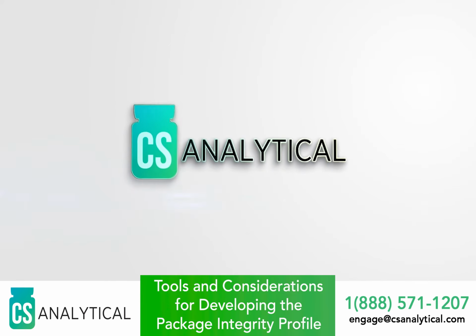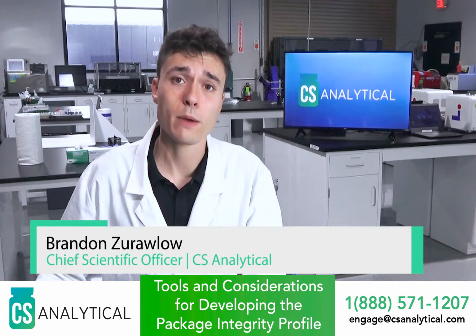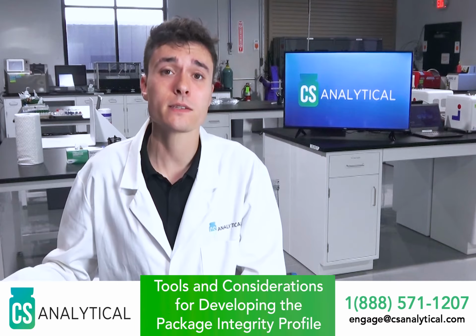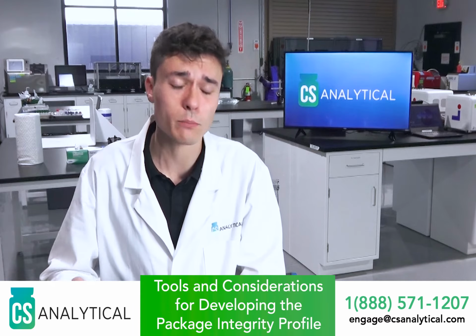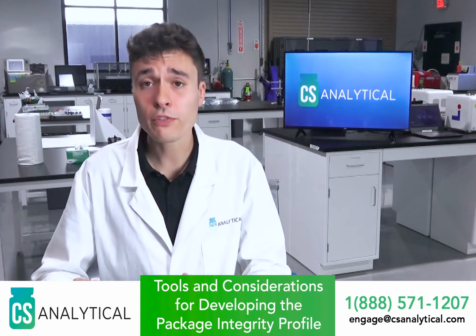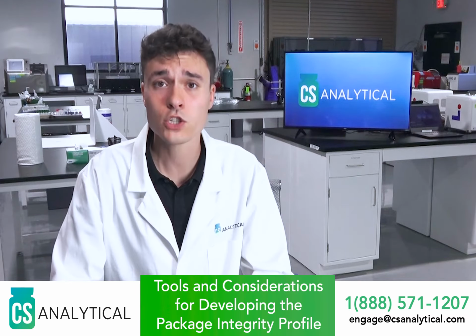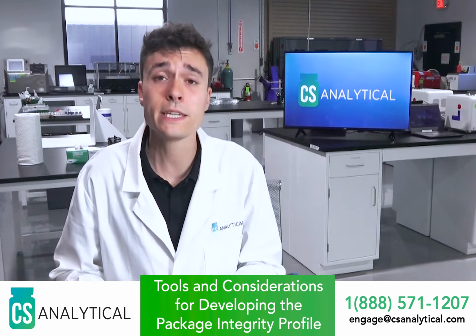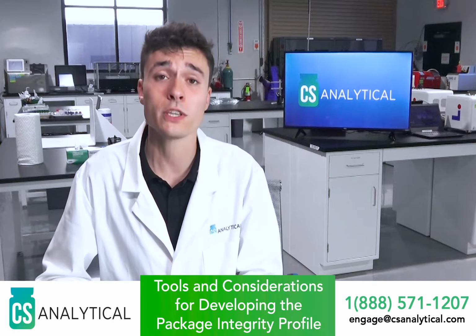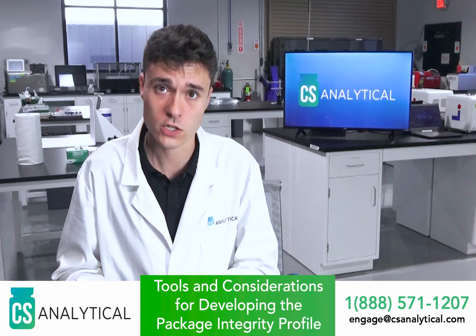So in addition to just considering the types of technologies that we might use to characterize the CCI of that product package system, again, this is not a checkbox type test. We're not looking at CCI just at a point in time, one time to verify it and move on. There very much is opportunity to use different types of technologies, or even things that aren't leak tests, and implement different control strategies to support what's called the package integrity profile of that product package system.